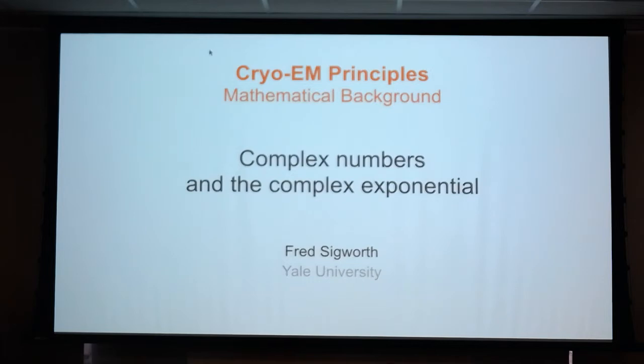And do you want to hear half an hour about Fourier transforms? I see an alarming number of people nodding their heads. All right, so the first hour is going to be those basics of Fourier transforms, and then the second hour is going to be going from all of that knowledge base to how do we get clean images from noisy images, how do we do reconstruction, and so we're going to attempt the impossible.